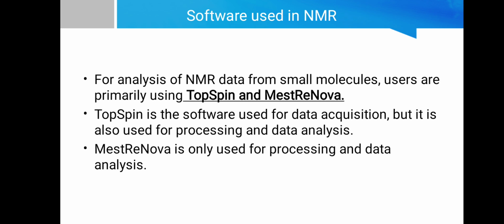For analysis of NMR data from small molecules, users are primarily using Topspin and Mestrenova. Topspin is the software used for acquisition, but it is also used for processing and data analysis. Mestrenova is only used for processing and data analysis.